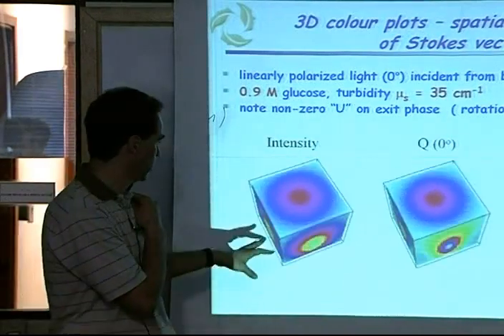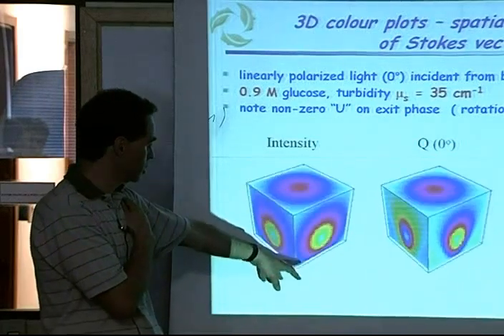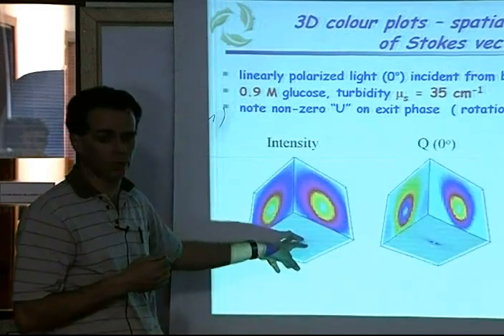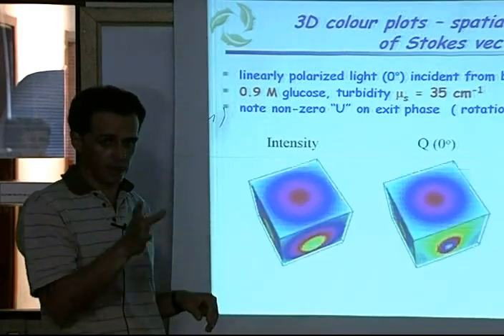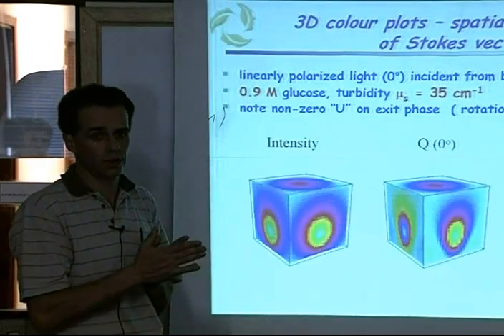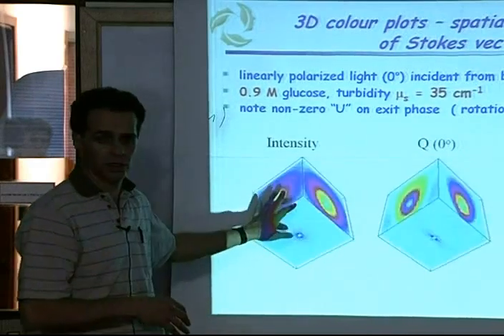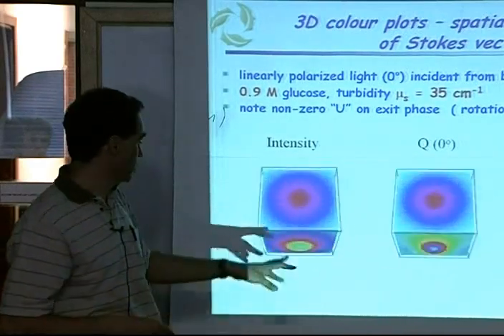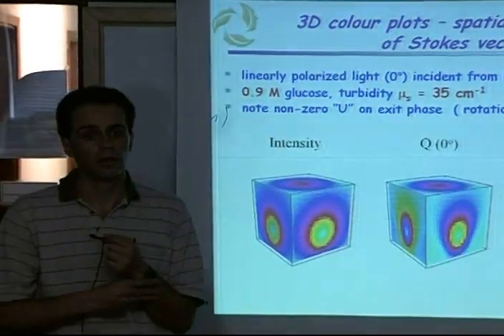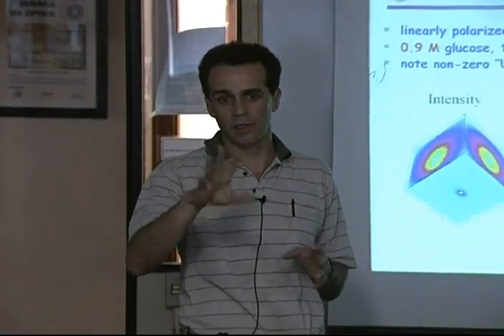You are looking at the 90 degrees probably. No, we're looking everywhere. It's just we're not scoring. You're right. In this particular orientation, we're not scoring because we want to show where the incident light is. But absolutely. Mind you, right at 180, the reflection is not very large. There is a fair amount of light, almost at this level around here. We're just not showing it. Yeah, retroreflection is right here. So I'm not worried about the retroreflection or the scattered light, because if you are scattering that amount at 90 degrees, there's going to be some probably at 120, 130, absolutely, yeah.